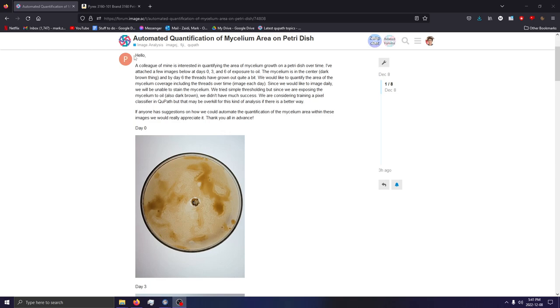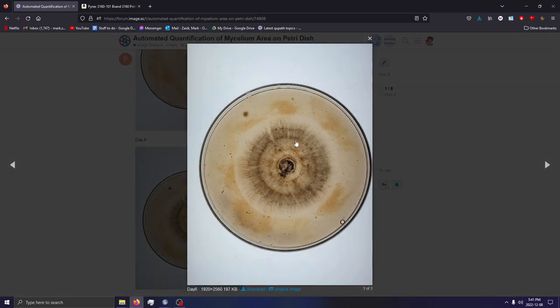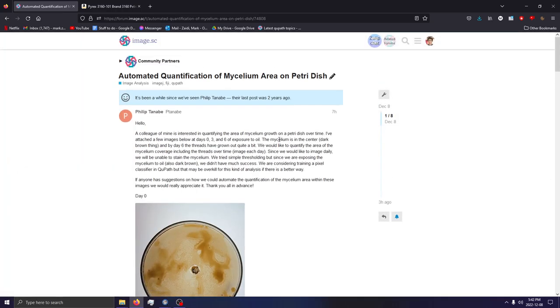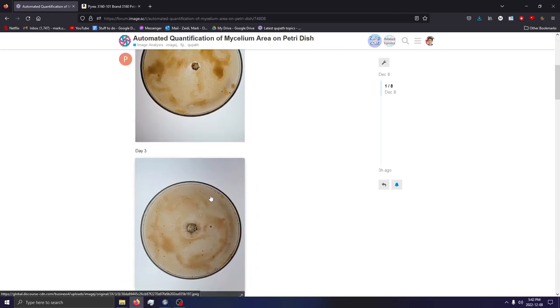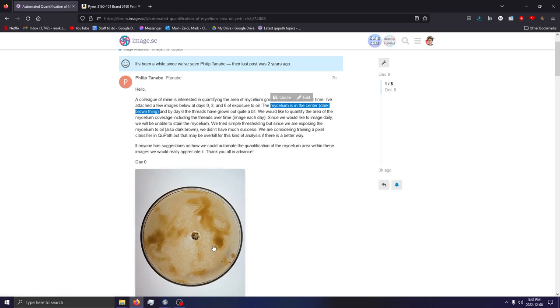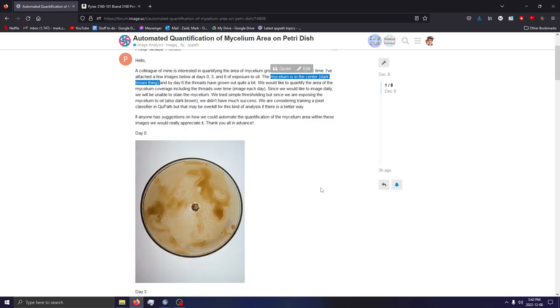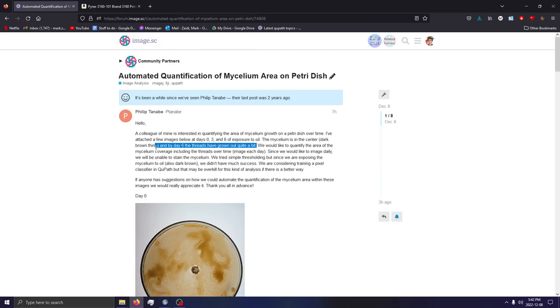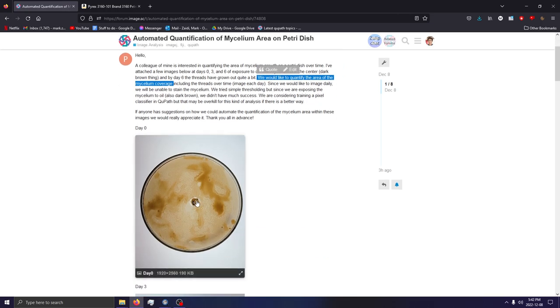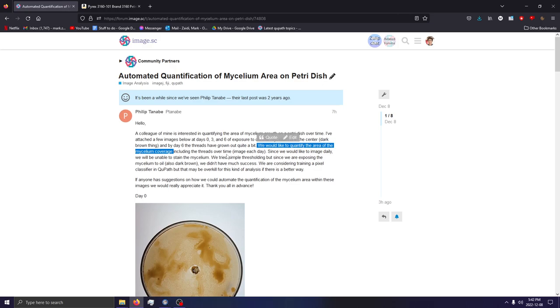Just a quick summary: a colleague of mine is interested in quantifying the area of mycelium growth on a petri dish. My understanding is this brownish area is mycelium and these individual hairs are called hyphae. The mycelium is in the center — a dark brown structure — and by day six the threads have grown out quite a bit. So we have day zero, day three, and day six, and they want to quantify the expanding and spreading nature.